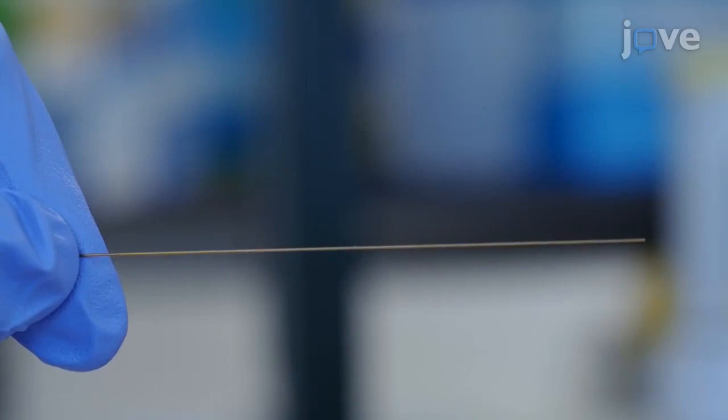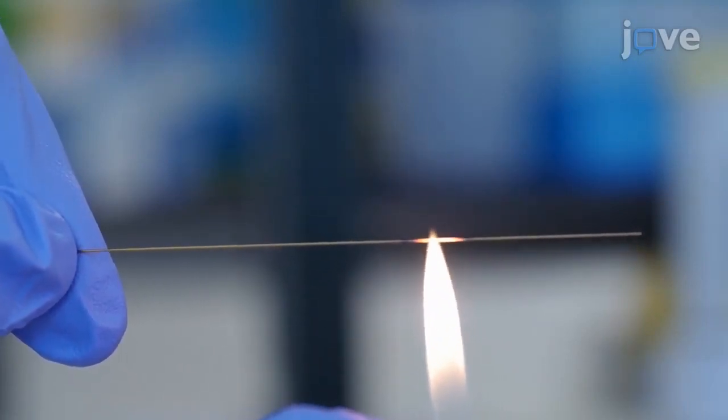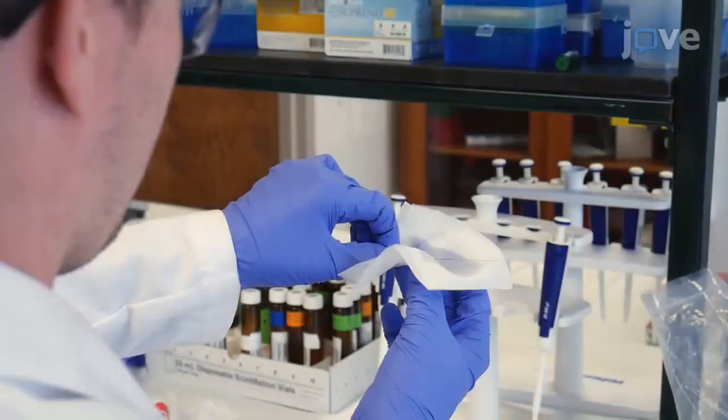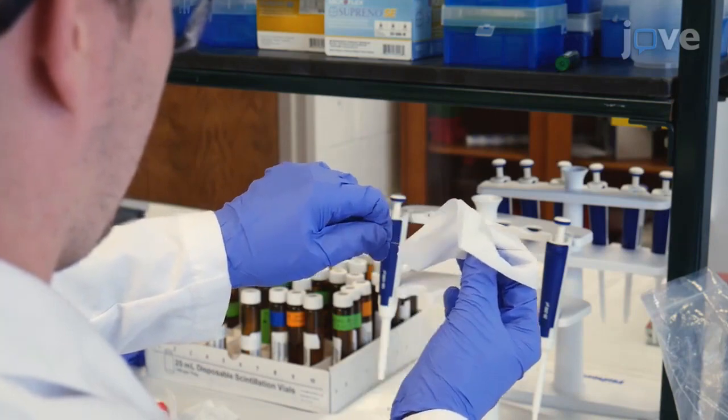Burn a portion of the capillary using a gentle flame to remove the polyimide outer coating around 4 cm away from one end of the capillary. Gently clean the burnt portion by wiping to remove the polyimide coating completely.